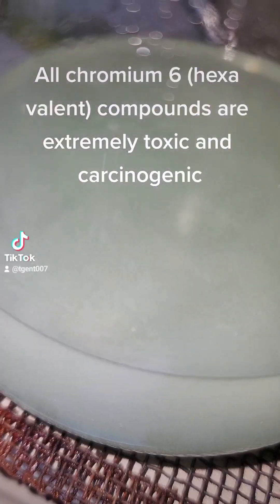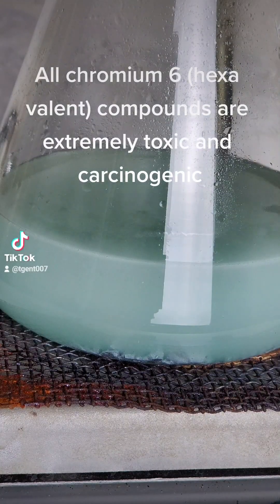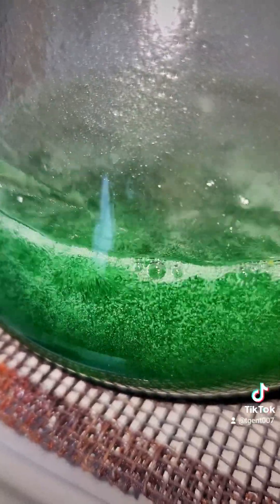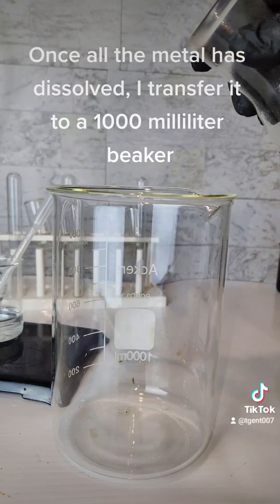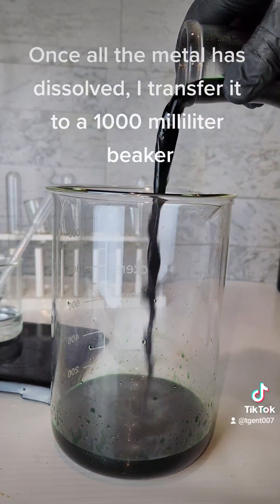All chromium-6 hexavalent compounds are extremely toxic and carcinogenic. This process will also take three parts to finish, but I will combine them and post as a single video on my YouTube. Once all the metal has dissolved, I transfer it to a 1000 milliliter beaker.